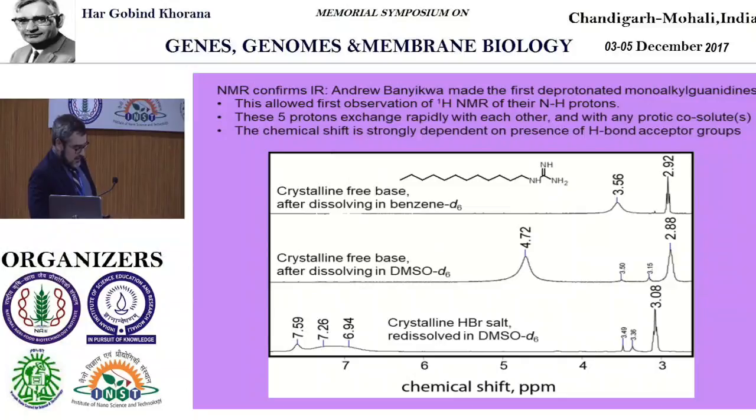An interesting aspect of these NMR is that you can't observe these chemical shifts for the guanidine group in the presence of even small amounts of water. They exchange very quickly, and all you see is a band corresponding to the water chemical shift. Even solvents that you think would work are problematic. So we don't show this in chloroform.